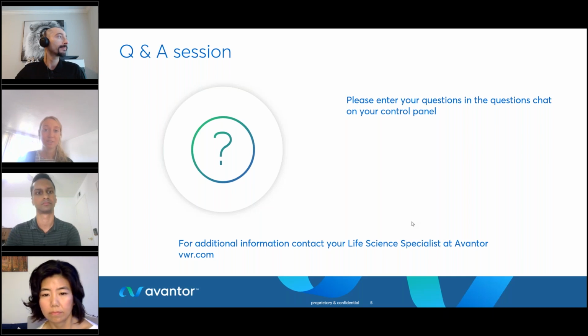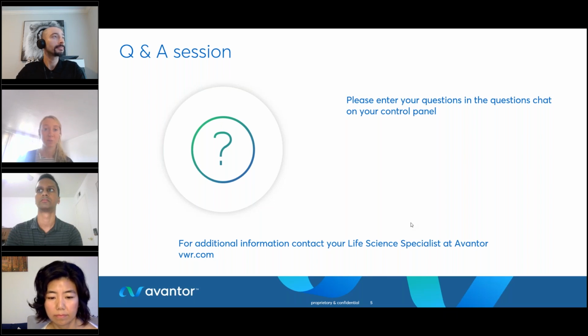Thank you. And Sarah, do we need a reference sequence for each plasmid when you're sequencing them? So you don't need a reference for each plasmid because we're doing de novo assembly. You can, if you want to, supply a reference for the insert. And if you do that, then a few extra quality control steps will be done at the end of the workflow, just comparing that insert with what was assembled.